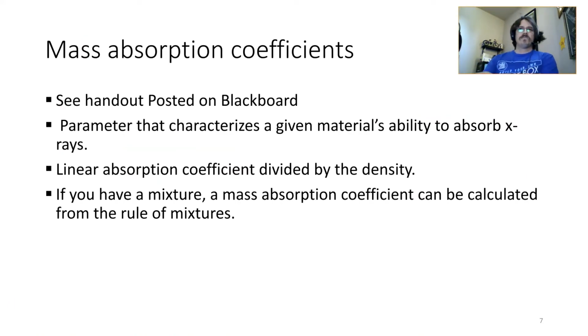All right, mass absorption coefficients. I've posted a handout on Blackboard giving some tabularized mass absorption coefficients. Sometimes this data is actually kind of hard to find, but I found another database of mass absorption coefficients that I'm happy to show you in this lecture. It's a parameter that characterizes a given material's ability to absorb X-rays. It's essentially the linear absorption coefficient divided by the density, and we talked about this already.